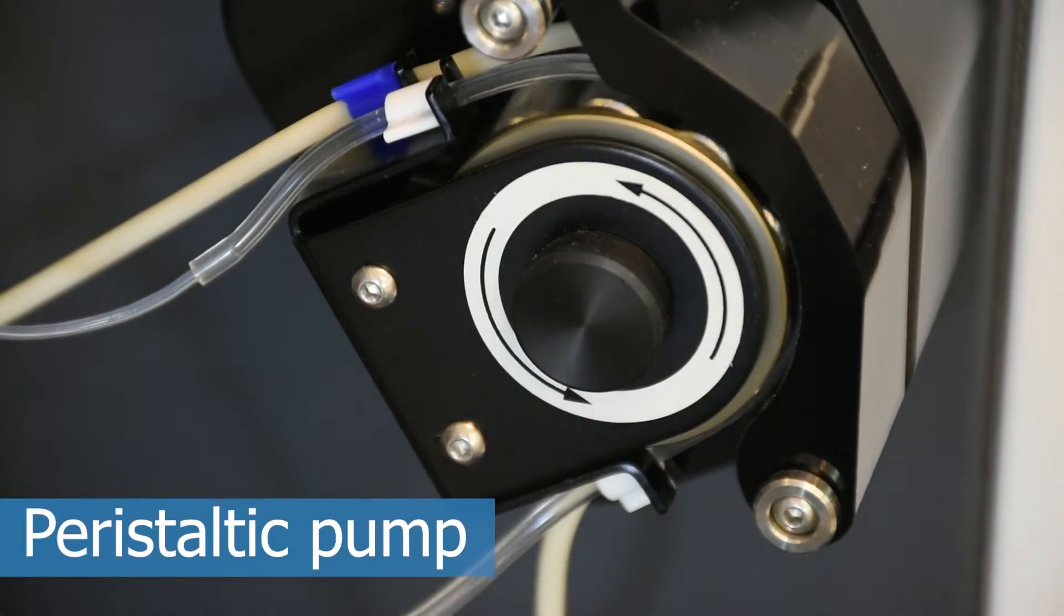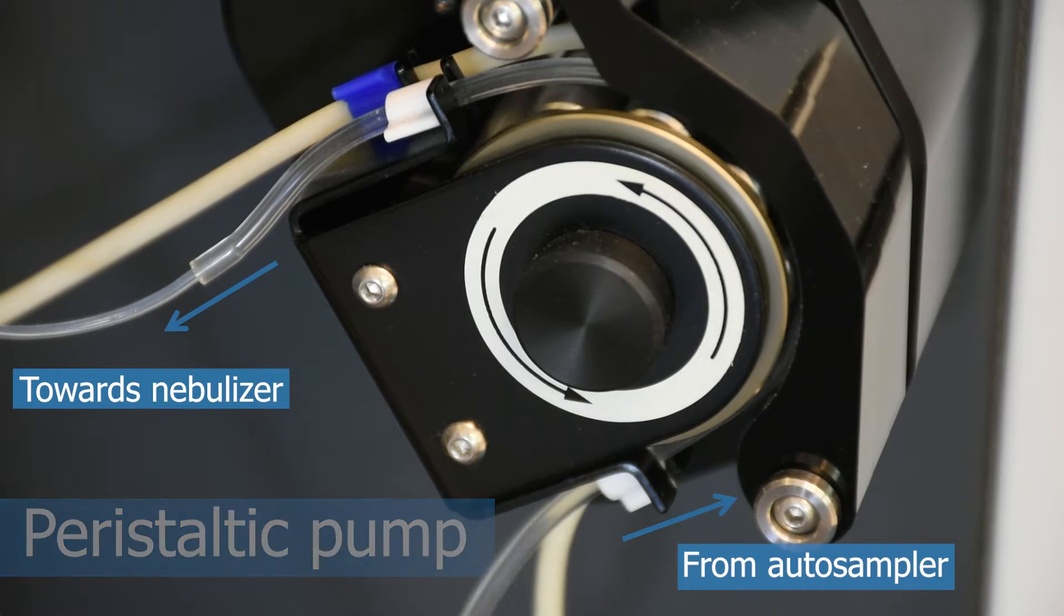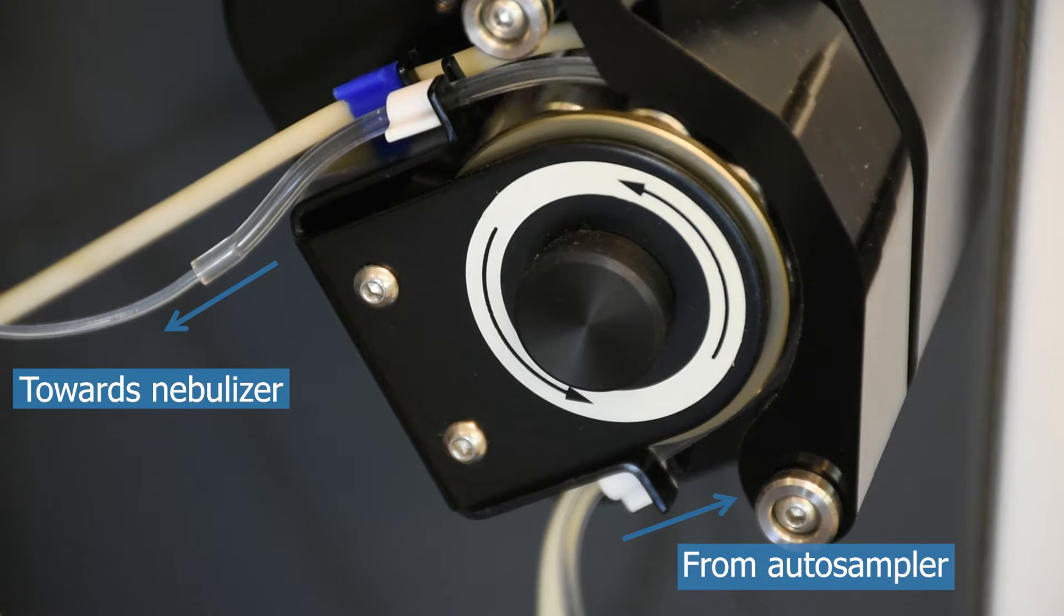A peristaltic pump draws the solution through a capillary tube, taking it from the autosampler and bringing it to the nebulizer.